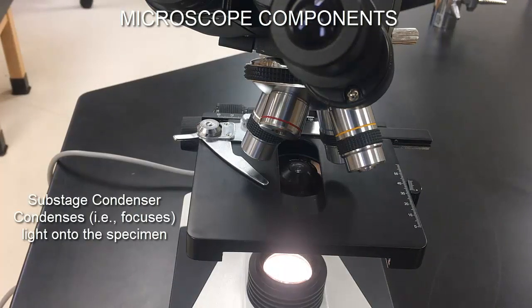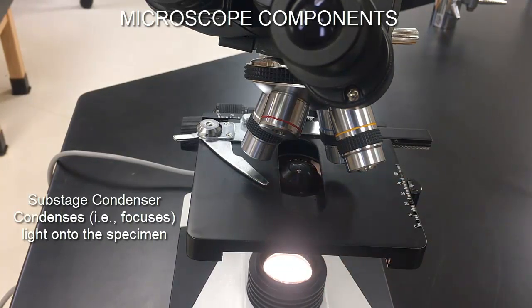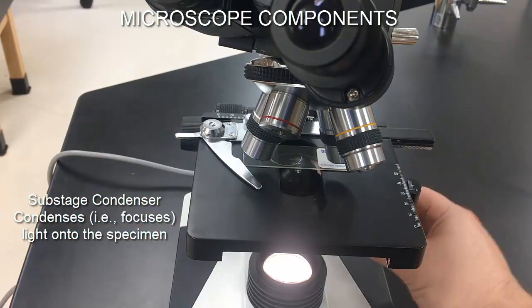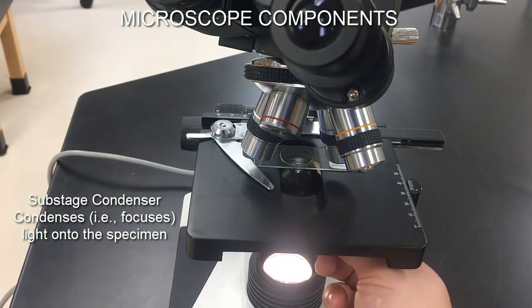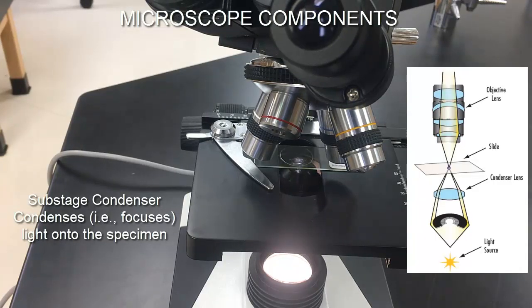The next component is the sub-stage condenser, sometimes just called the condenser. It's located right in the middle of the mechanical stage. The light from the bottom of the microscope comes up through it and hits the specimen on the slide. This condenser takes a broad array of light and condenses it into a strong, focused beam right onto the specimen for high intensity illumination.